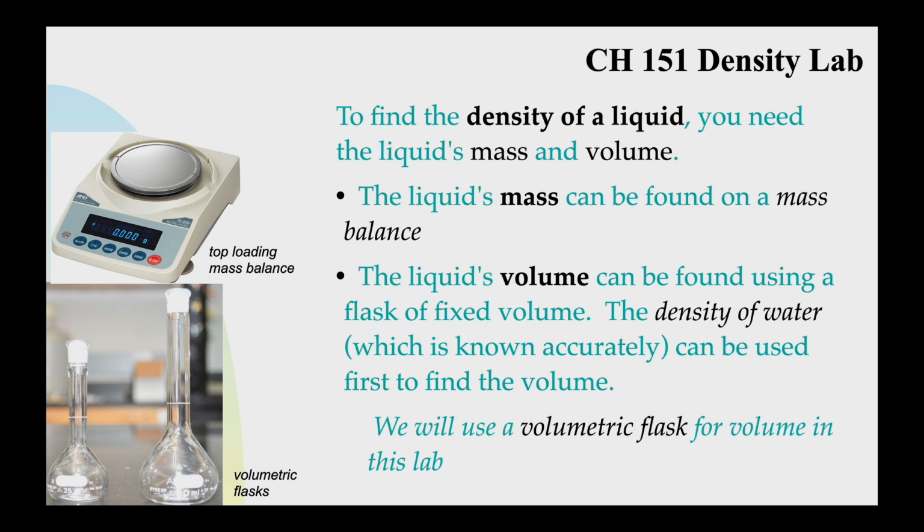The mass you can find from that balance. And literally, it's like you have the container that's empty and the container that's full of liquid. And the difference between those two would be the mass of your unknown liquid. The volume, you do need some kind of a reference point. The density of water has been studied extensively, and so values of the density of water are known very accurately.